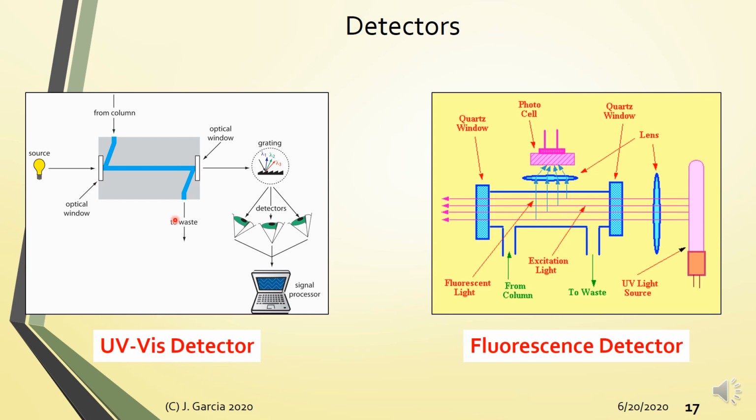instruments is that you can miniaturize any instrument design. Alright, so you also have a light source here. UV-Vis detectors are equipped with both the deuterium lamp as UV source and the tungsten lamp as visible source. So the same precautions are observed. The light source is a consumable, so from time to time, you have to check whether you need to replace the light sources. Alright, so you also have your gratings, and then your detectors. Detectors can either be photodiodes or photomultiplier tubes. Okay. You can also use photodiode arrays if you want to improve the analysis.